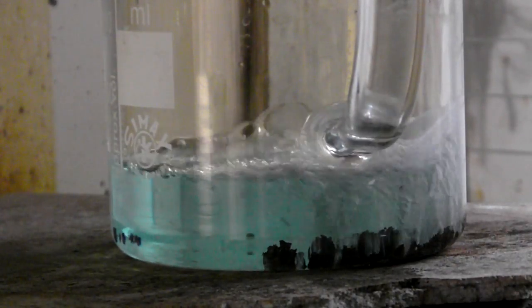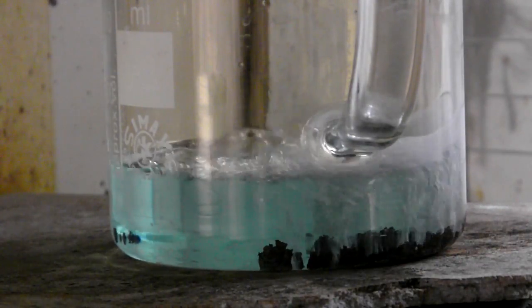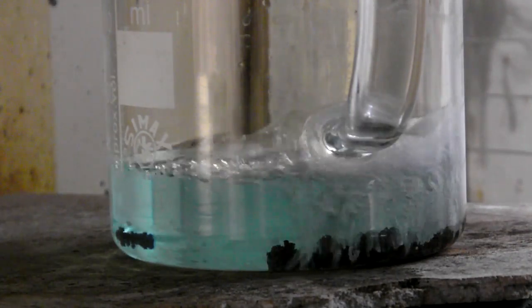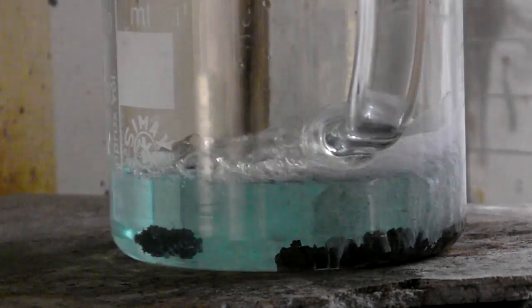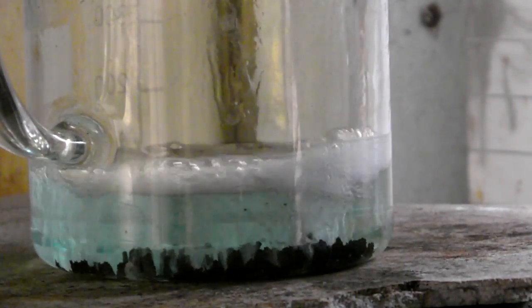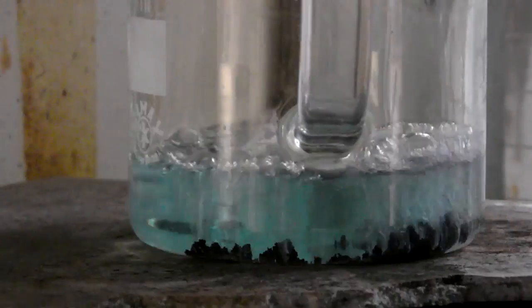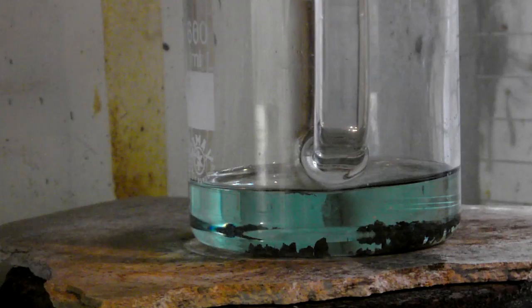When there are no more brown fumes evolving, the silver nitrate is decanted and a fresh portion of acid is added. When the fresh acid produces no reaction, the silver nitrate is decanted.